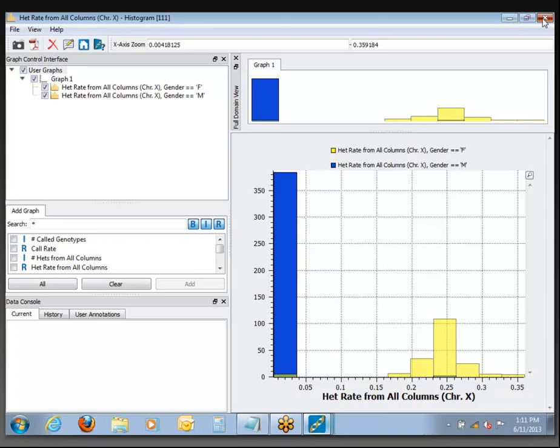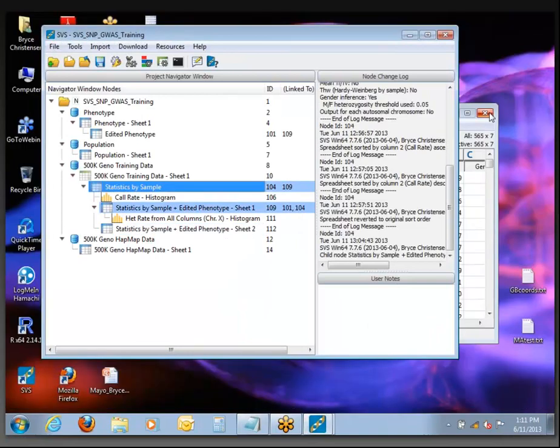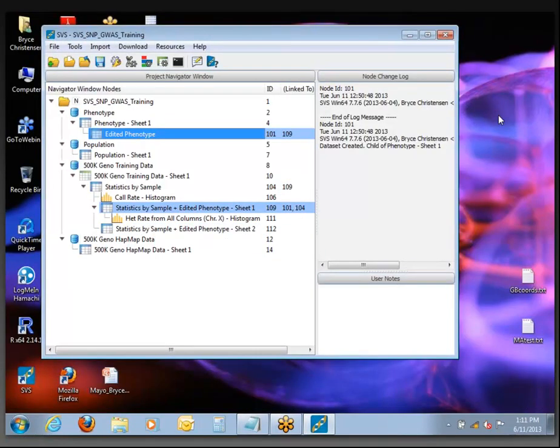To do this, we're going to come back to the project navigator — you might want to close down some windows. You can see as we've gone along we've already created a bunch of output nodes. That's something that takes a bit of time to get used to in the software — we don't always realize how much output we're creating in an analysis project, especially coming from R or other programs where the output is not always right there in your face.